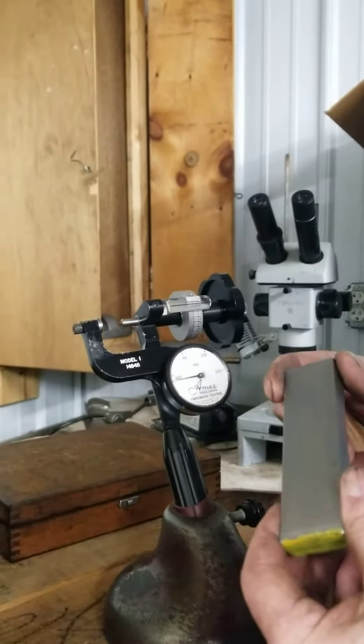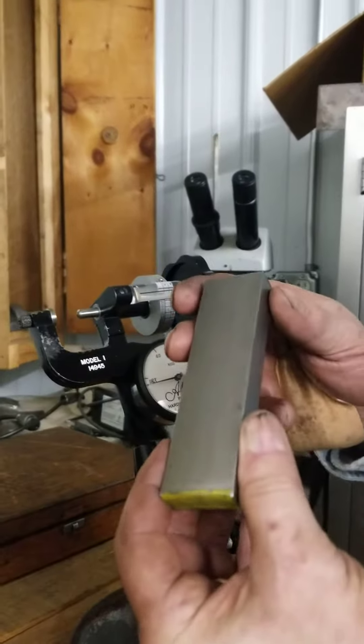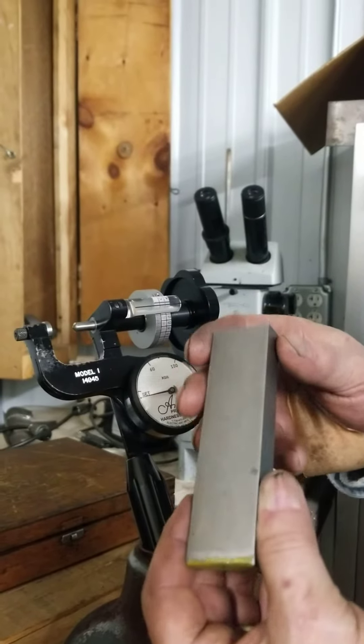I'm going to show you how to use an Ames Hardness Tester. I'm going to test the hardness of this piece of steel.